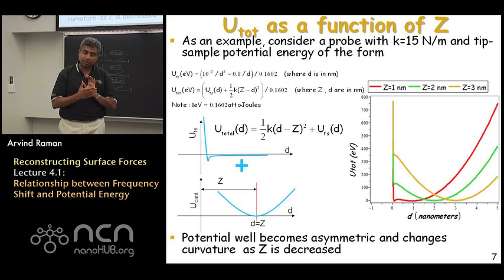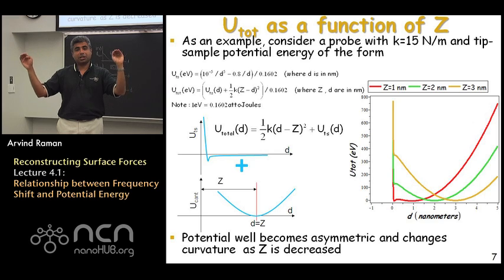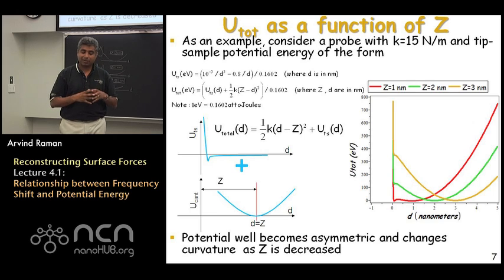On the other hand, as you come closer to the surface, z equal to 2, you find that the potential energy well, due to the cantilever, doesn't have time to increase too much in height, so that the potential energy due to the attractive interaction forces, the repulsive interaction forces, are able to modify it. When you come very close to the sample, z equal to 1 nanometer, you actually find that the effect of the tip sample interaction forces on modifying the overall potential is very substantial.